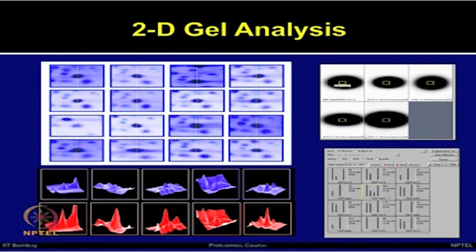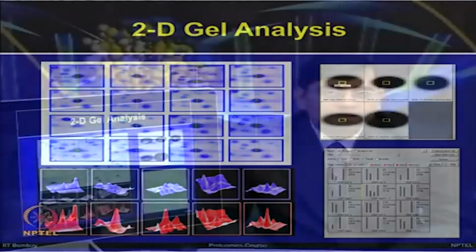So, after looking at the three-dimensional views of this particular protein, you can confidently say that this protein expression is changing and it is going to a higher amount in the treatment. Now, one can look at each of these spot intensities in much more detail, and then plot different types of parameters for percentage volume or spot intensity to compare their values and do the statistical comparison.